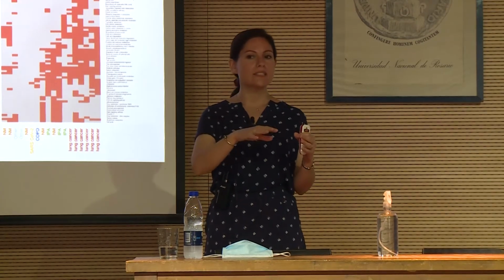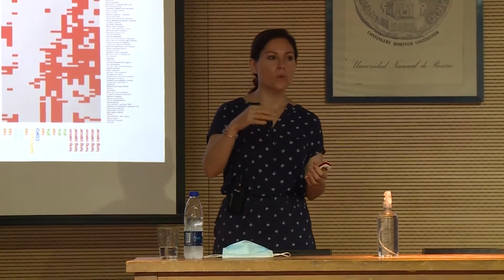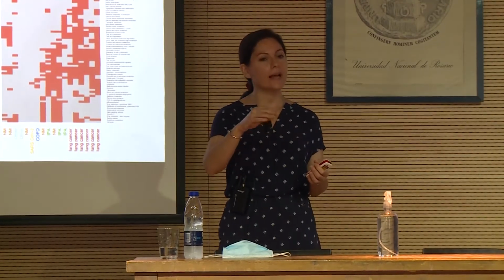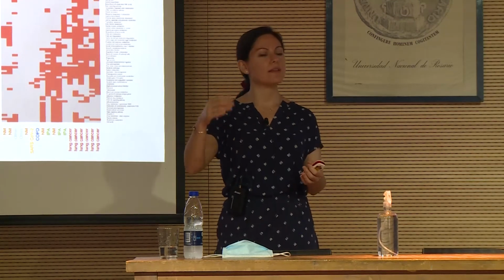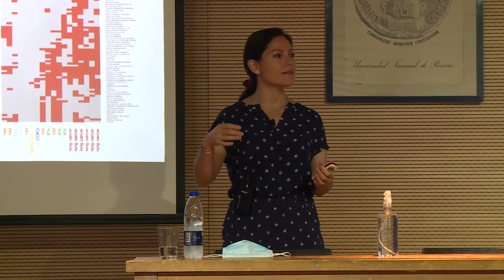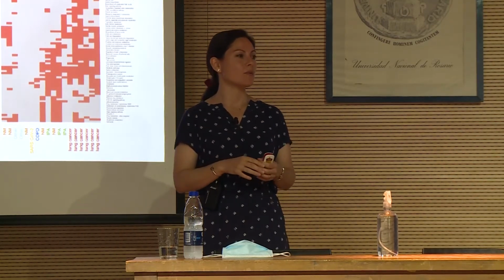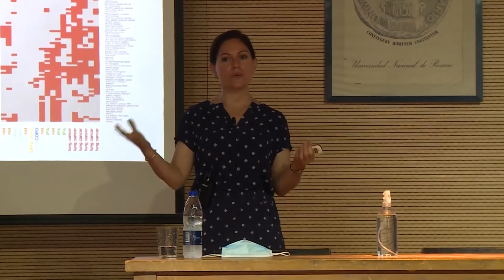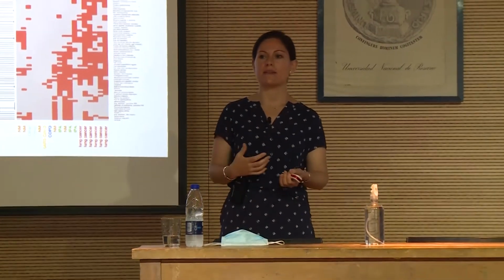Do you affect the results with your imputation? This is something that in the workflow we can quantify, and then in the output file you get a quality check: things that went okay and things that maybe distorted the results a little bit. Right. But basically you could do the same. If you know Perseus, you can get the information.